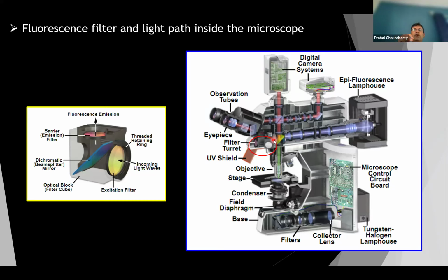So what will happen? We can see the actin fibers, because phalloidin only binds to actin fibers, and the phalloidin is tagged with a fluorophore called Alexa 488, so excitation is around 480 and emission is coming around 500 to 550. So I can see the green emission and the position of the actin fibers, and then I can use some other filter block to see, similarly, the mitochondria.